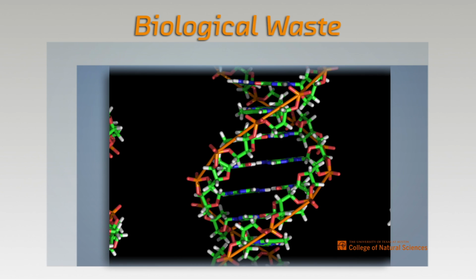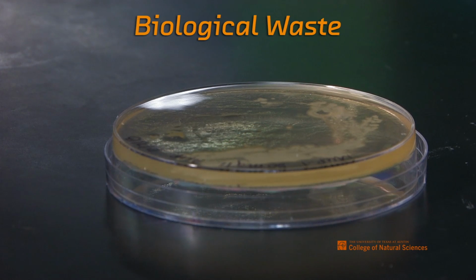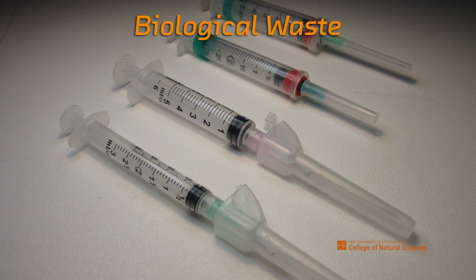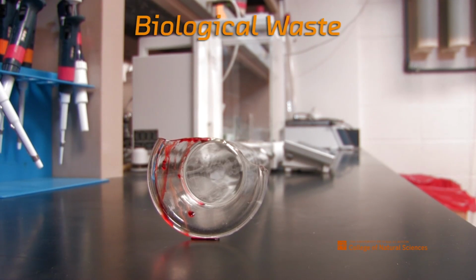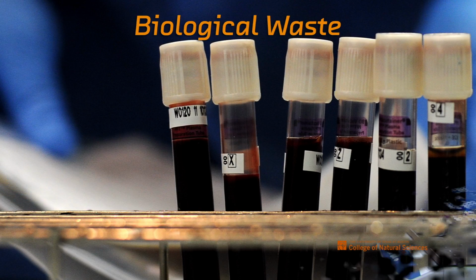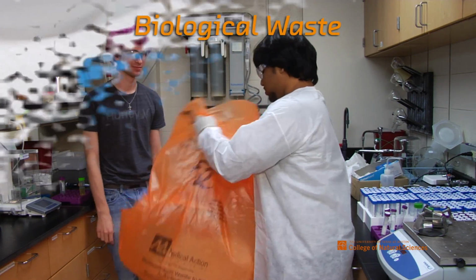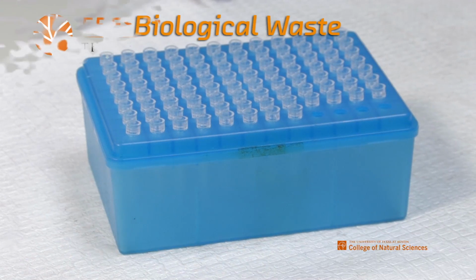Biological waste includes, but is not limited to, petri dishes, culture plates, needles and syringes, blood, vials, contaminated personal protective equipment, and used pipette tips.